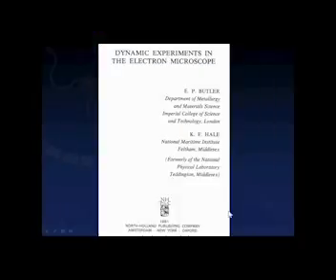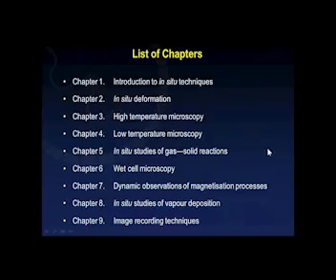In the year 1981, there is a seminal book published by Butler and Hale entitled Dynamic Experiments in the Electron Microscope. And if we look at the list of chapters in this book, you will see stimulus such as deformation, high temperature, low temperature, gas-solid reactions, wet cell microscopy, magnetization, etc., which are in fact the same stimuli that were presented in the 2012 papers.